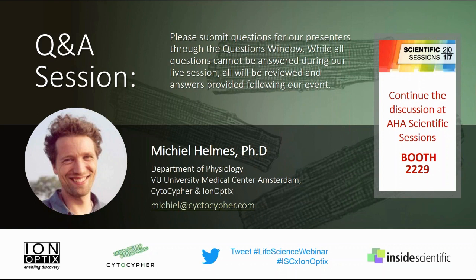If you take out the user bias, you also take cells that you maybe otherwise wouldn't check, like cells that are very contractile or have very little contractility, but at least you take out the bias. And if you do enough cells, they just become the tails of your distribution. So that's all right, I guess.